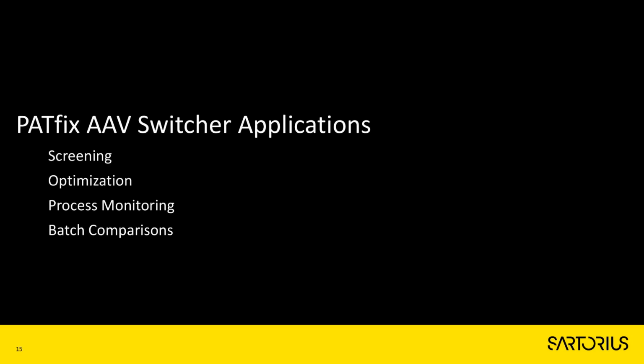Thank you, Blaž. So we're now going to the second part of the presentation where we are going to have a look into different applications. So our upstream process development team faced a challenge when we started developing an upstream process. And that challenge was the lack of a suitable, reliable analytical tool to measure empty-full ratio. And I'm sure that many of you following will also agree you had similar challenges.